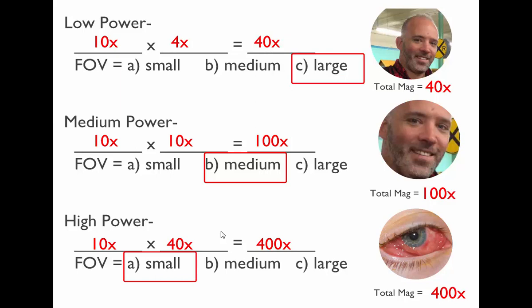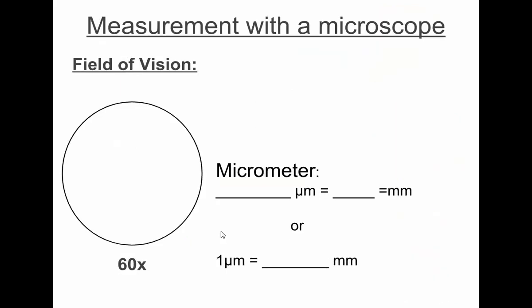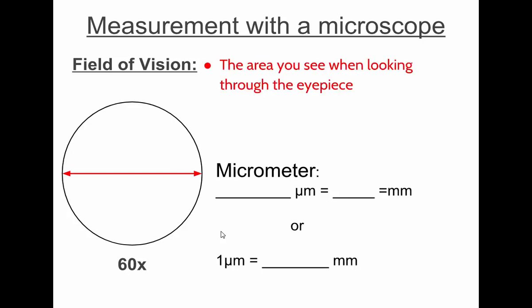All right. So, any questions about magnification? Let's get this slide off. The last thing we need to talk about is how we measure things with the microscope, because that's something you're going to have to do in our lab today. So we know that our field of view is this area we see in the microscope. And it has a certain diameter, and it's something that we can measure.